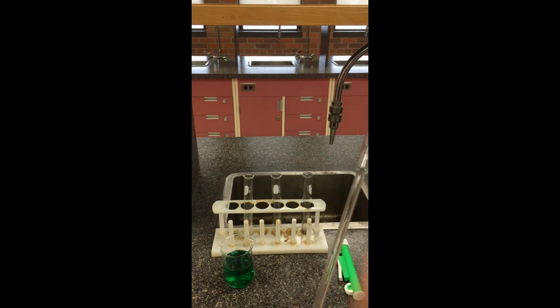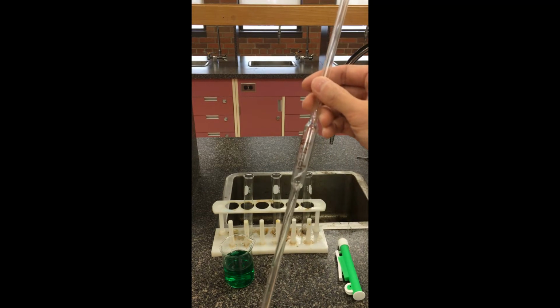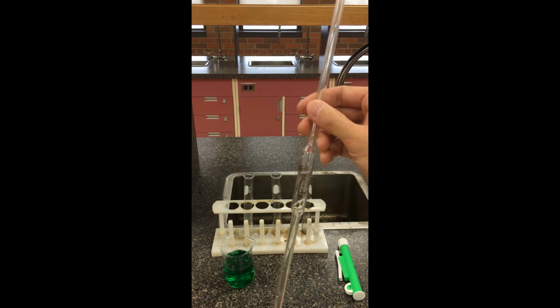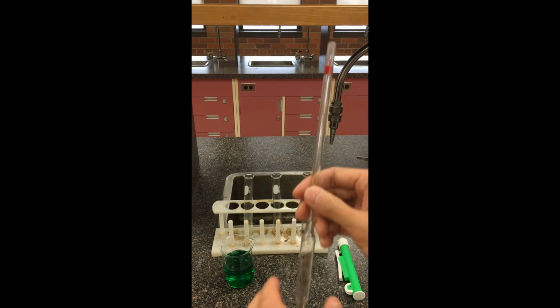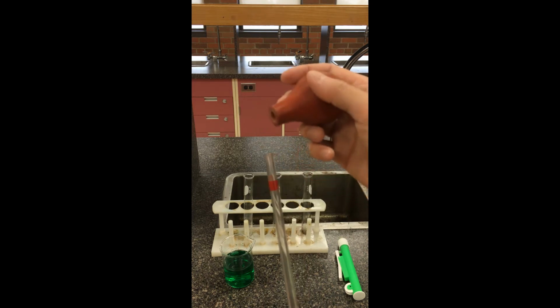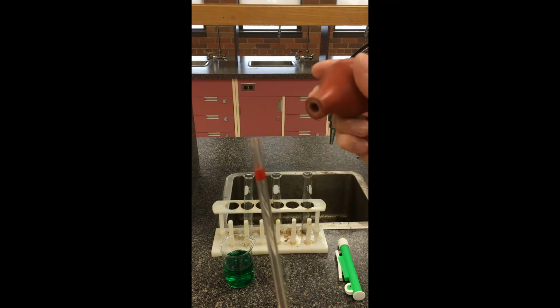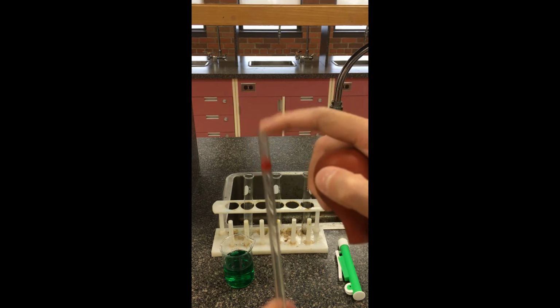For a pipette, you can think of it like a straw. In fact, chemists in the olden days used to use their mouth to pipette. As you can tell, that wasn't a very safe decision. Nowadays, we have a suction bulb to simulate the suction we would need. So you do want to find a bulb that matches the size of your pipette.